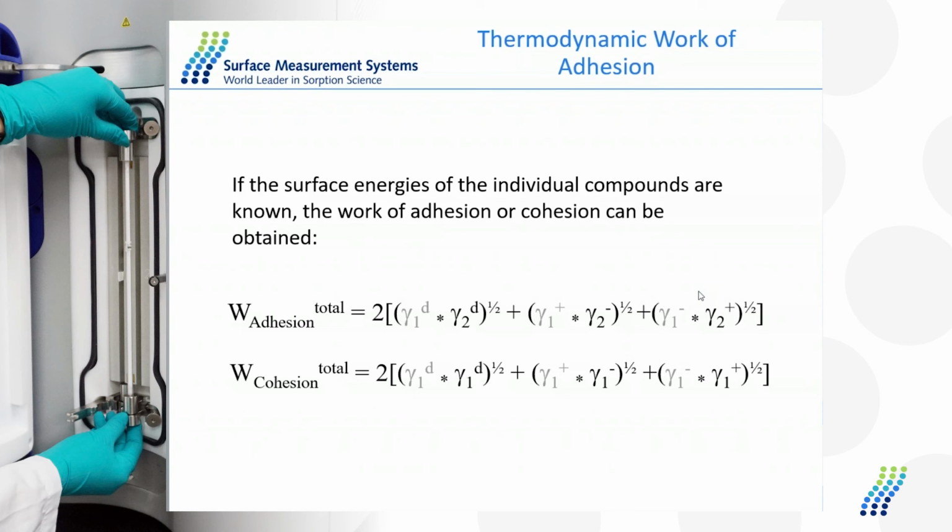There were several papers published by Peter York's group on different surface energies of polymorphs. That was when he was at the University of Bradford several years ago. If you let us know, I can send you some copies of that, if you maybe give that information to Brad, or you can look it up. But surface energy of different polymorphs has been identified, but I wouldn't say that it's an across the board rule, that they will always be different, and that the lowest thermodynamic polymorph always has the lowest surface energy.